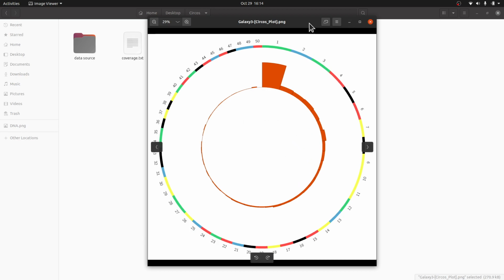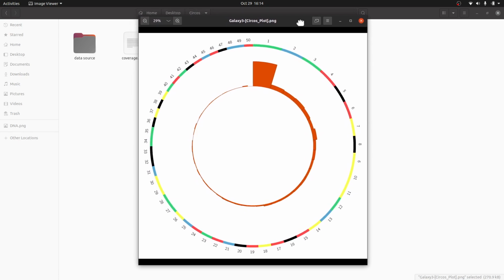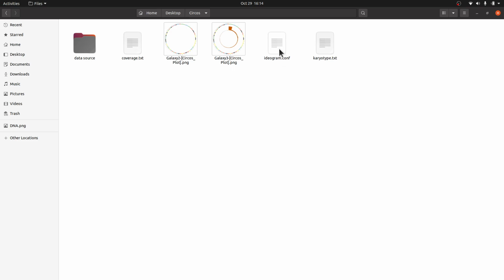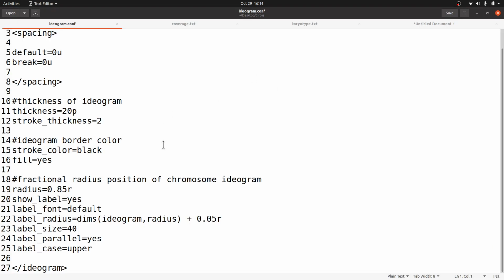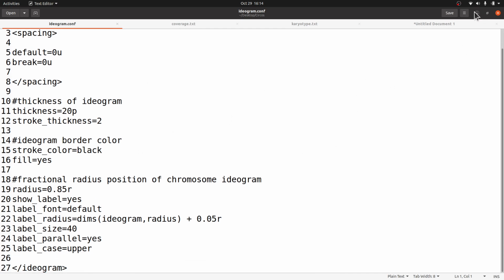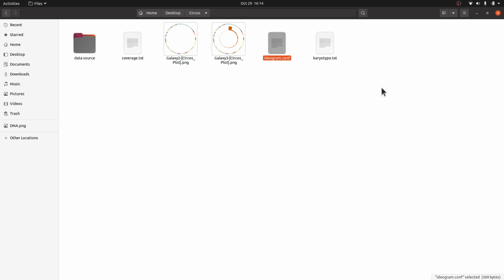Okay, so that's how we generate a coverage plot for genome assembly data using Circos, all right, on Galaxy. Please take note that on Galaxy, you don't need to have any programming experience, all right? So if we were to run this on the command line, then you need to, for example, have commands like this that will be used to specify options and then configurations for the plot. But in Galaxy, all of these things are done behind the scenes, all right? So all I have to do is just click, add, drop, drag, etc. Okay, so that's how we do it.